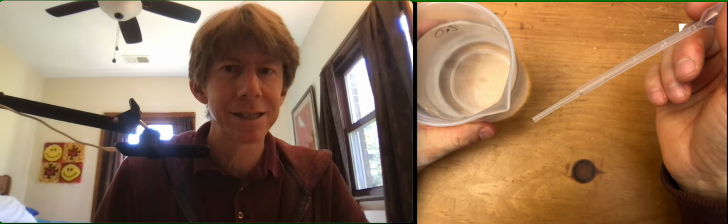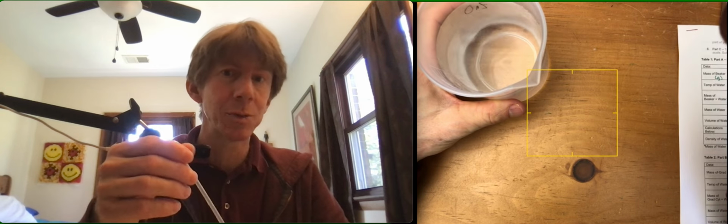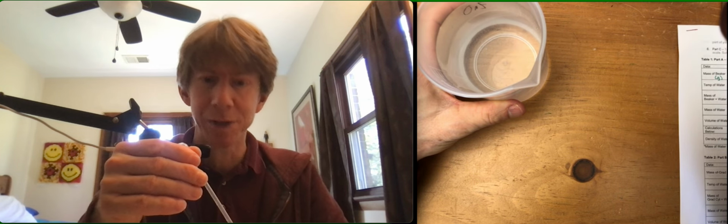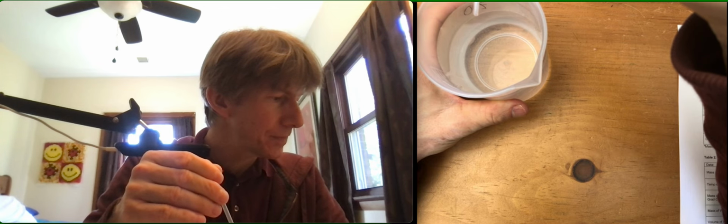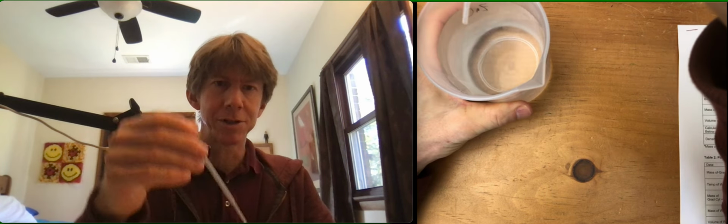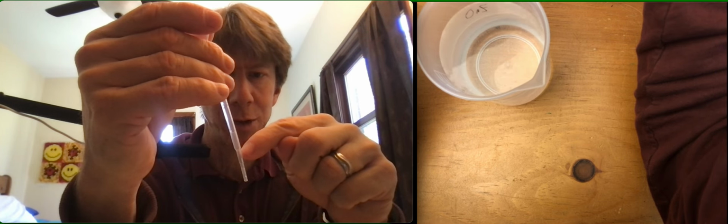Oh, I should say, this is just tap water, by the way, and tap water is okay to use. Distilled water would be better, and especially if you're gonna do reactions. Condition the pipette. Okay, so here's what you do. So I'm gonna suck up just up to about there with water. You can do more, but that's all you need.